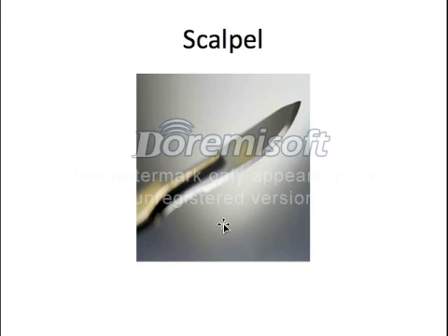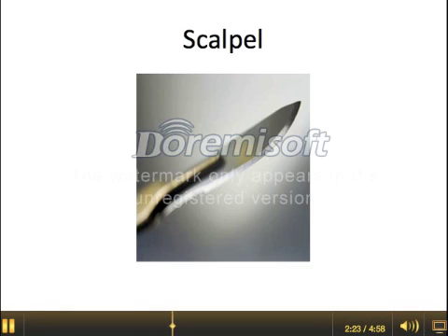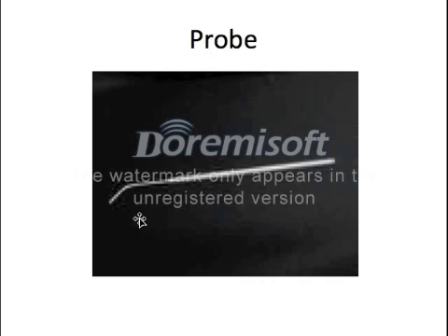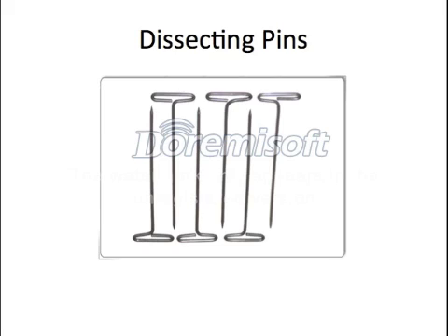The first instrument you'll be using is a scalpel — again, they're very sharp. This is the sharp end, obviously. It has a handle; you want to hold it by the handle and treat them with care. You don't want to push too hard when you're slicing open the worm — you want to cut very gently. In the past I've seen students kind of butcher the worm because they push too hard, so cut very gently at first. A probe is another instrument you'll be using. It has a blunt end that you're going to use to point out the different structures that you locate on the worm during your verbal quiz that you'll take with me during the lab. Dissecting pins are used to pin back the skin on the worm and to give you an area to view the internal part of the worm.